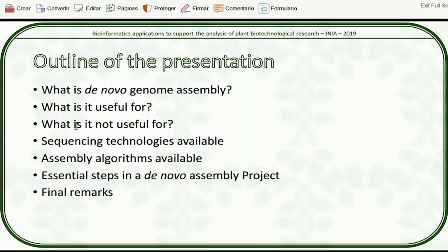Those reads that you were just exploring, SIM1 and SIM2, belong to a genome. And we want to see if you can infer the original sequence of it and how much it looks like the actual reference genome it was based on. And finally, once we see the essential steps, we'll do some final remarks about how each species you tackle with de novo genome assembly is different, it's going to have its own problems, and it's going to have its own methods of tackling those problems.